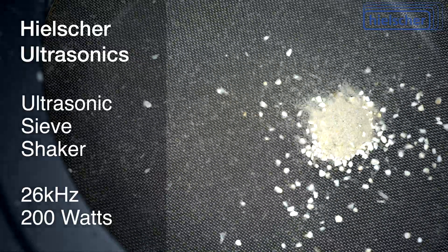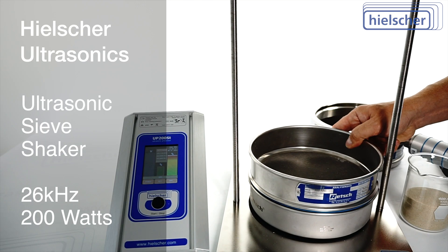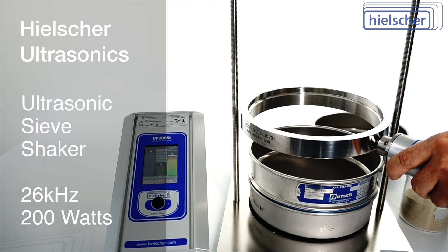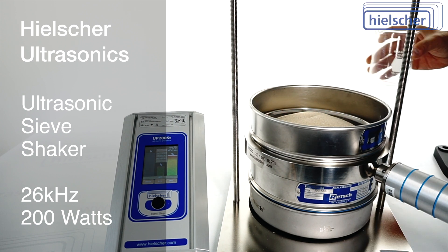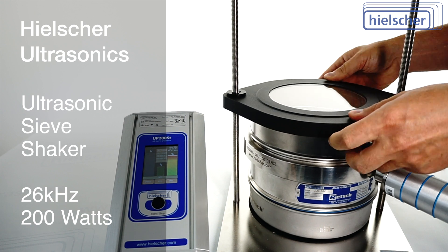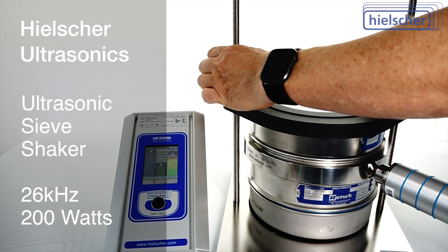In fact, many wet powders and slurries can be ultrasonically screened too. Using the ultrasonic sieve shaker is very easy. When stacking the test sieves, you position the ultrasonic ring between two sieves and tighten as usual. You can also use the ultrasonic sieve shaker together with conventional sieve shakers.